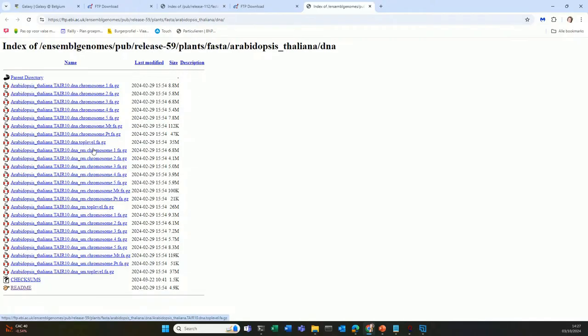And also here I would go for the original one, so not for the repeat masks or the soft masked version.